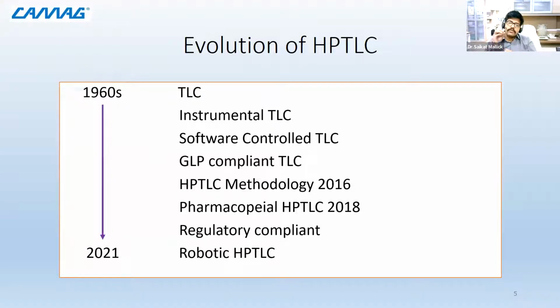Implementation of GLP was enforced so that you have a particular strategy to do this analysis. It should not be an open platform where anything is coming and it is being done anyhow.